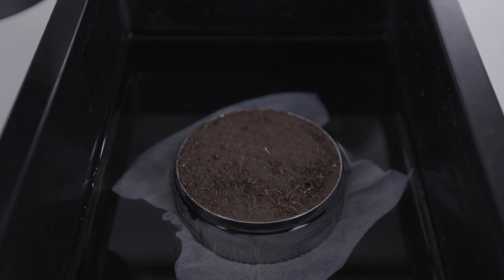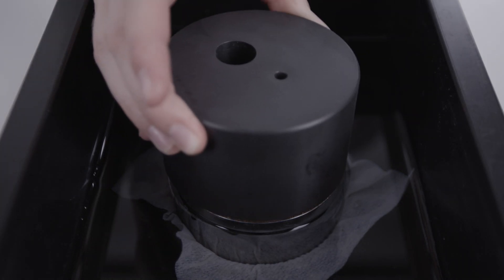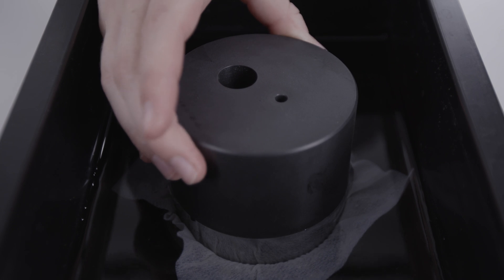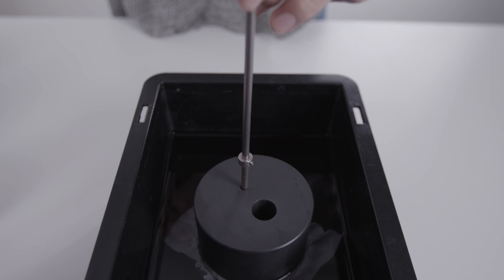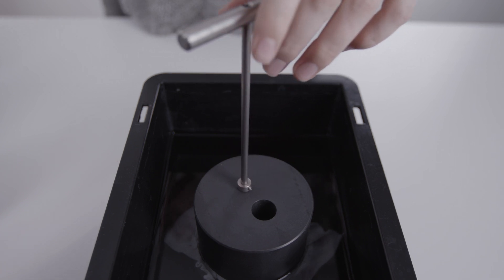To assemble the sensor unit and the soil sample, set the auger guide onto the saturated soil sample in the water container on the cutting edge of the sampling ring. The small hole should be above the sample ring weight lettering. This makes finding the right position easier when the sensor unit and the soil sample are assembled.